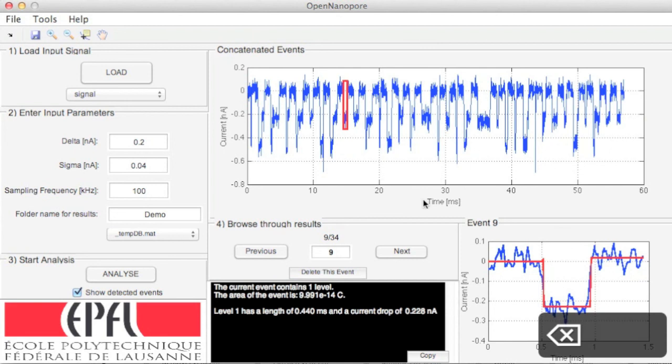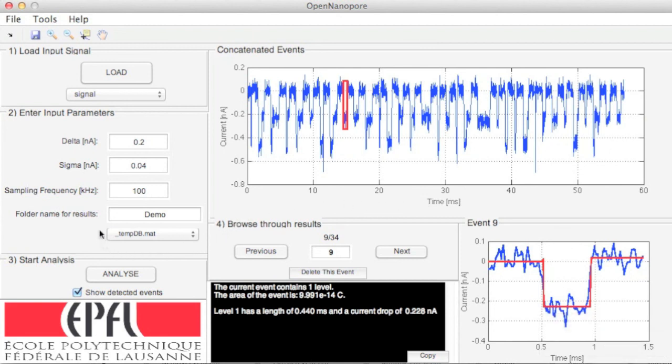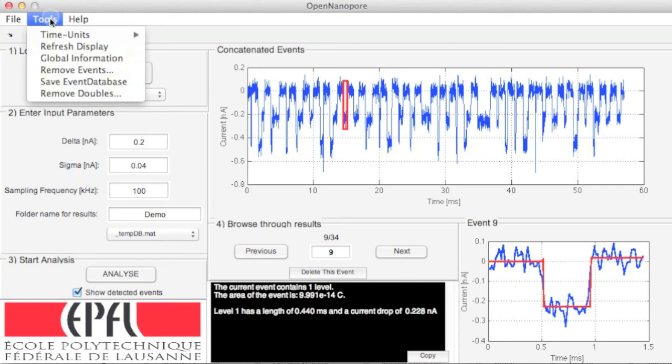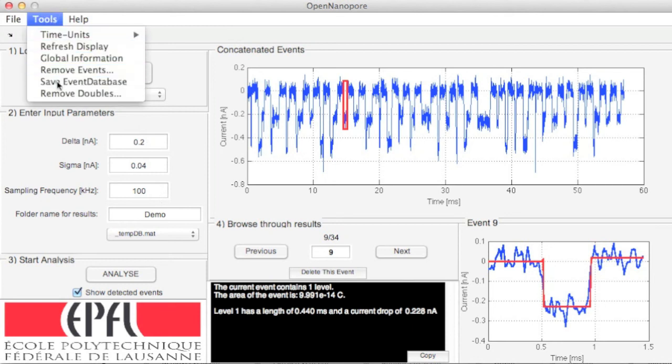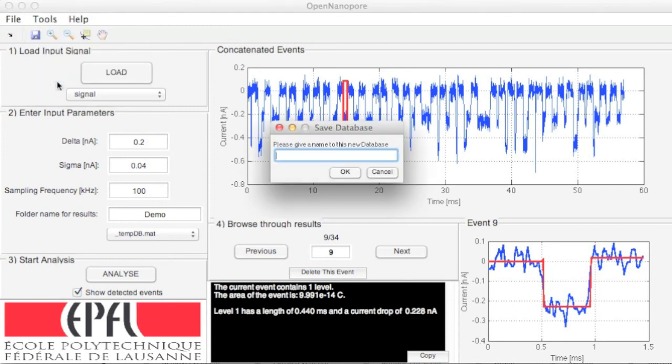While you modify the database, a temporary file is created, and it will be deleted when you close the software. Once you are satisfied with your verification step, you can save the results without the deleted events. This will create a new event database, new concatenated signal, and new concatenated fits.